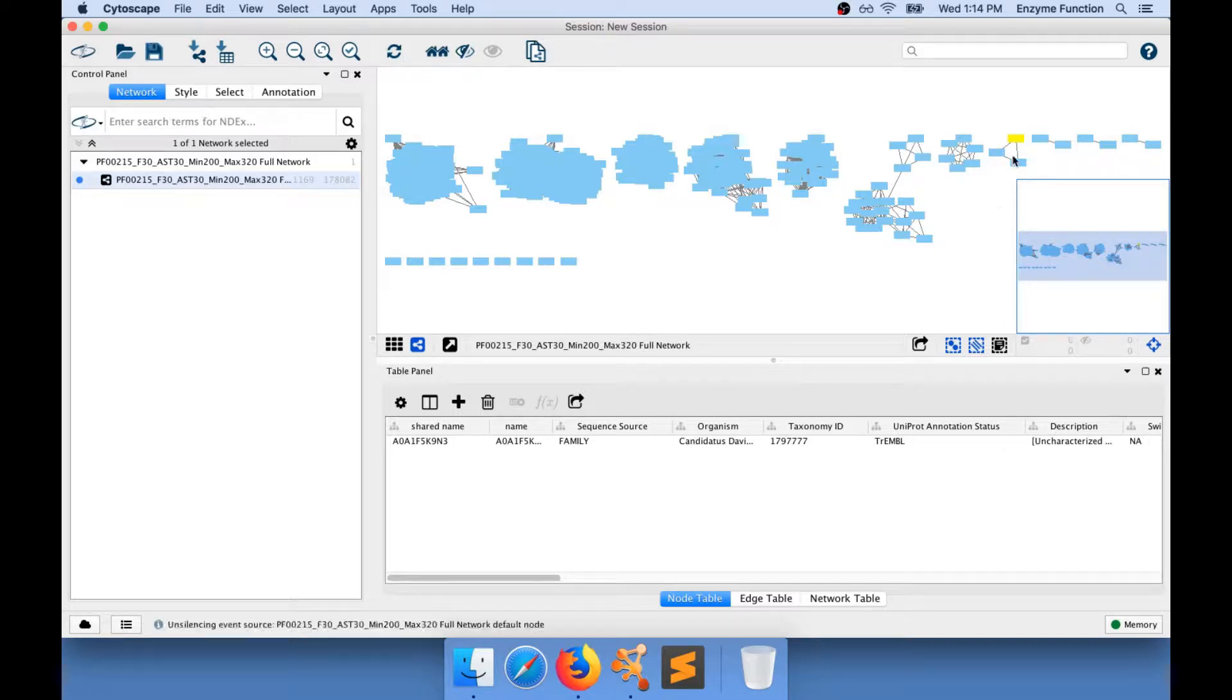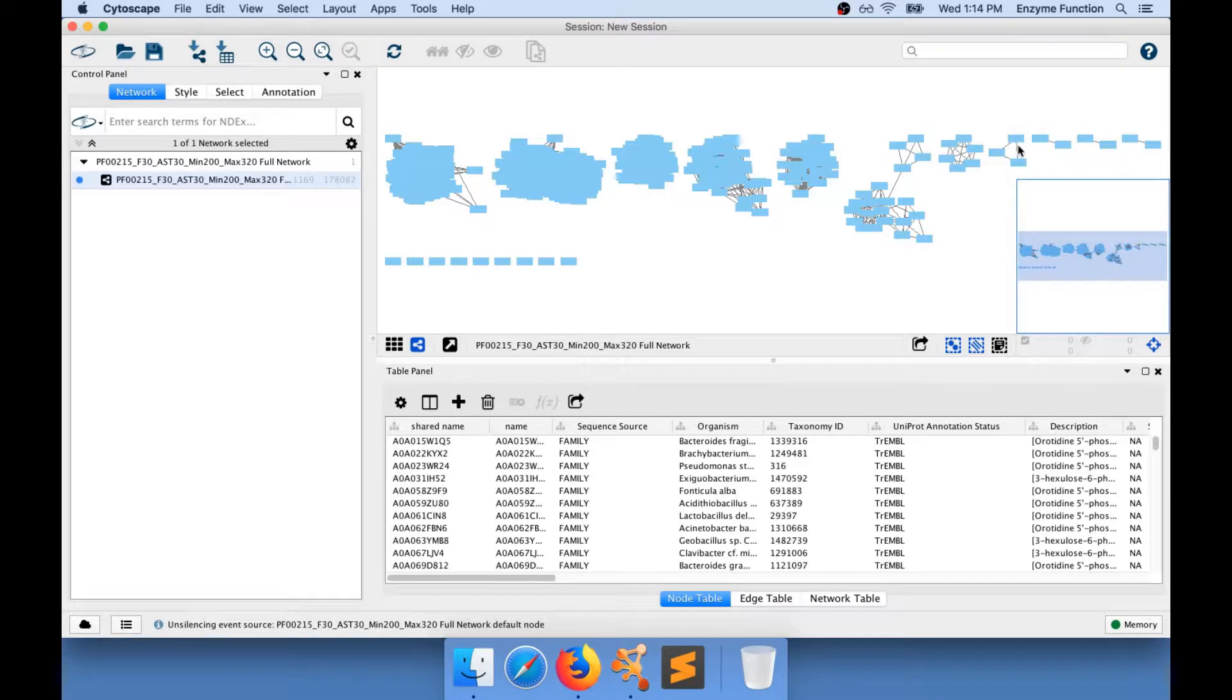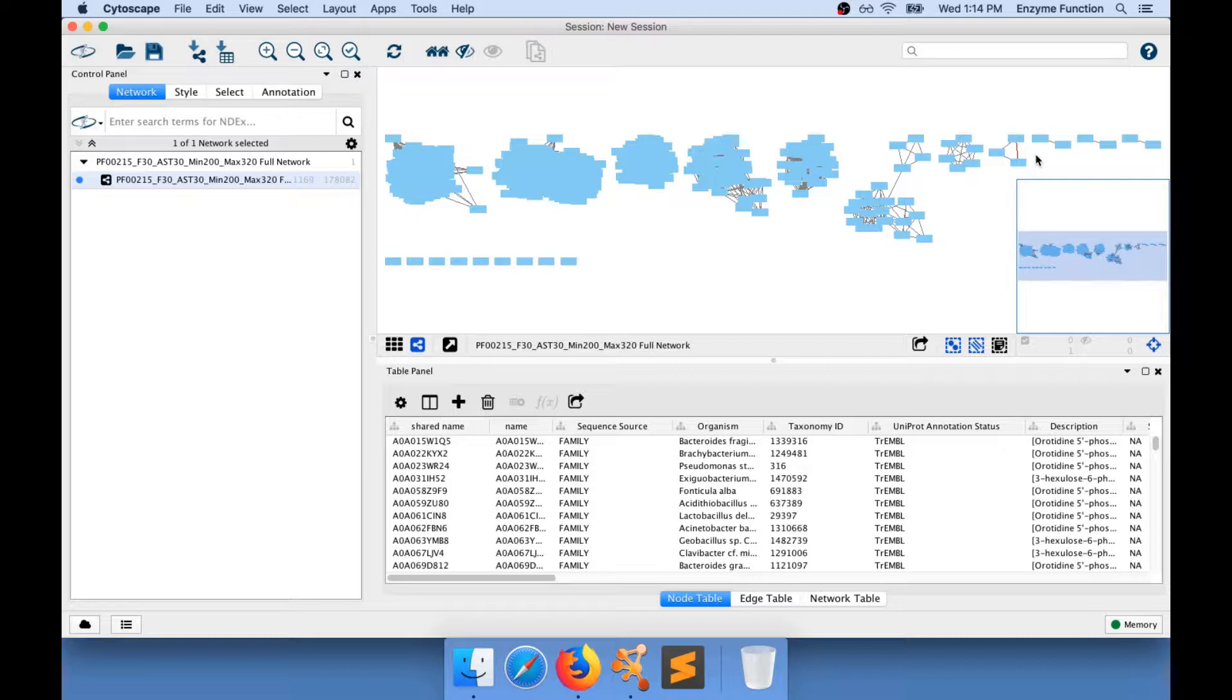Between nodes, sometimes you will see an edge. Edges are drawn between nodes only when the similarity between the sequences represented by the nodes is higher than the threshold value applied.